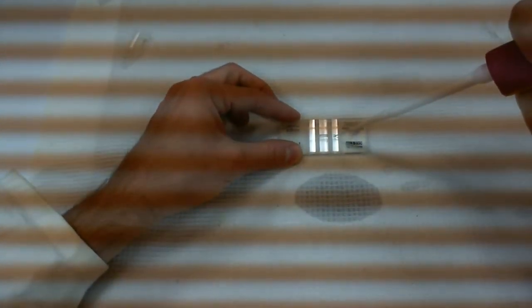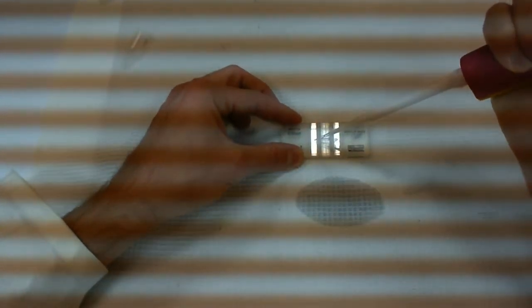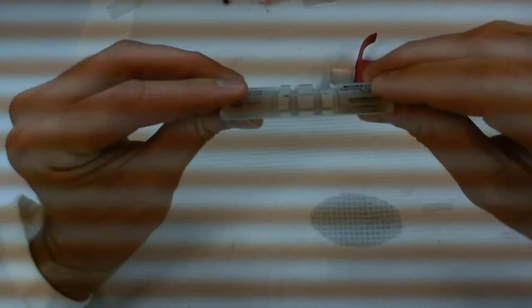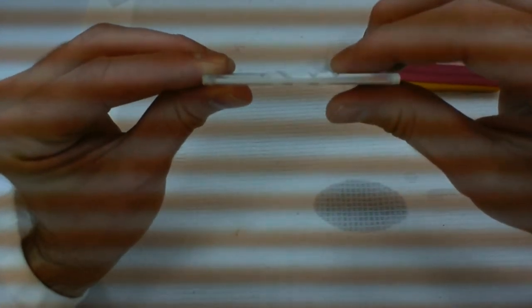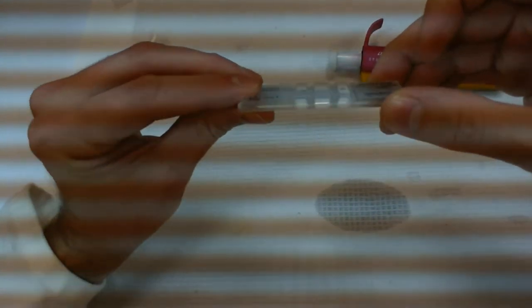Again, there's no need to measure this out. Just go ahead and put a small drop on one side, maybe a little bit bigger than this. Another drop on the other side of the shoulder. Again, you're not adding anything into the trenches, just on the shoulder itself. Just to be clear, this slide has these cut out grooves. Those are the trenches. And so what we have is water on top of the shoulders, not inside this area here. It's all going onto the shoulder of the slide.